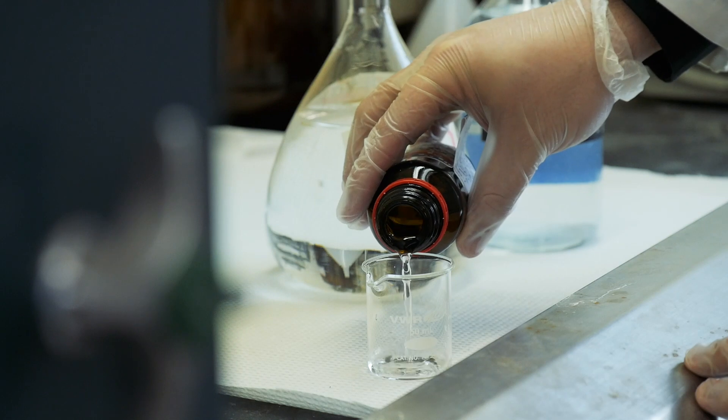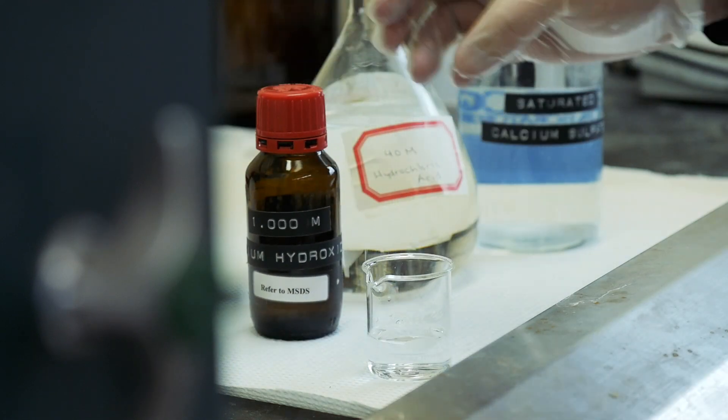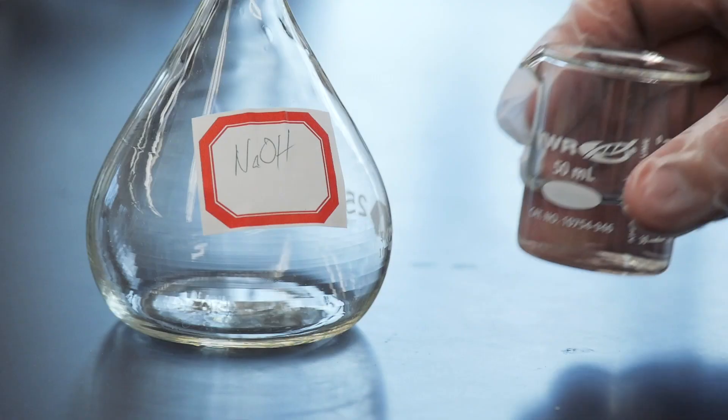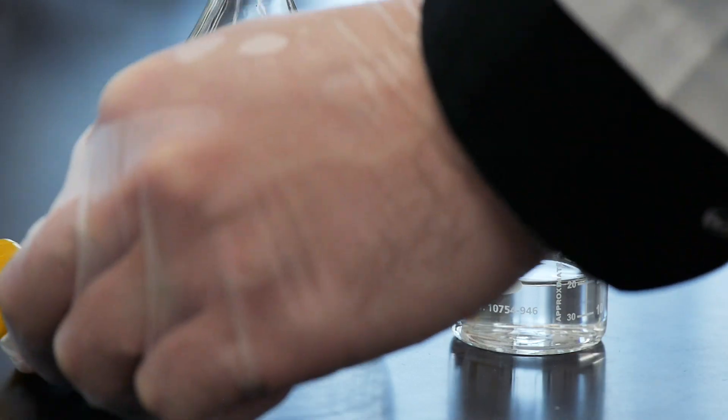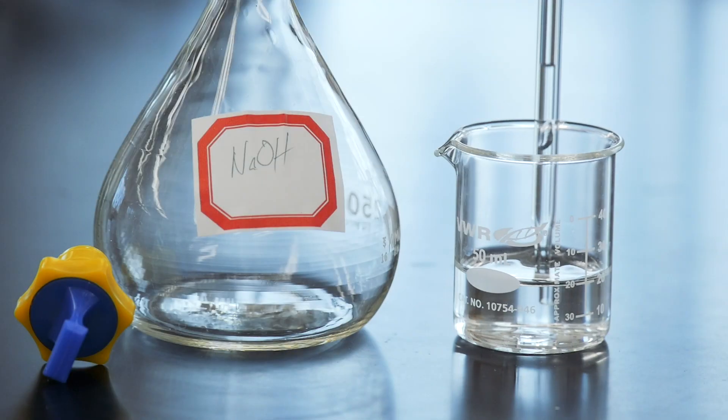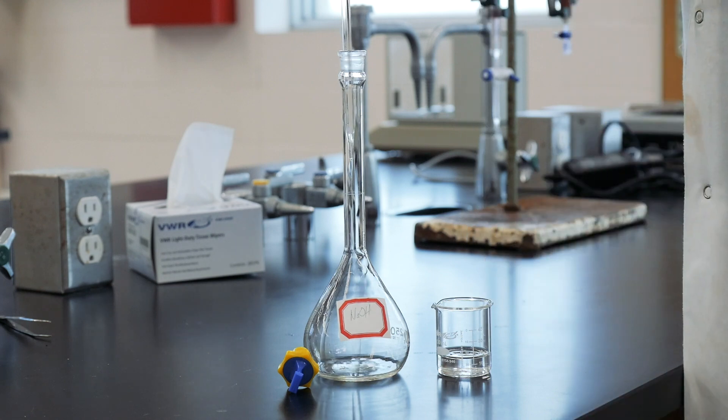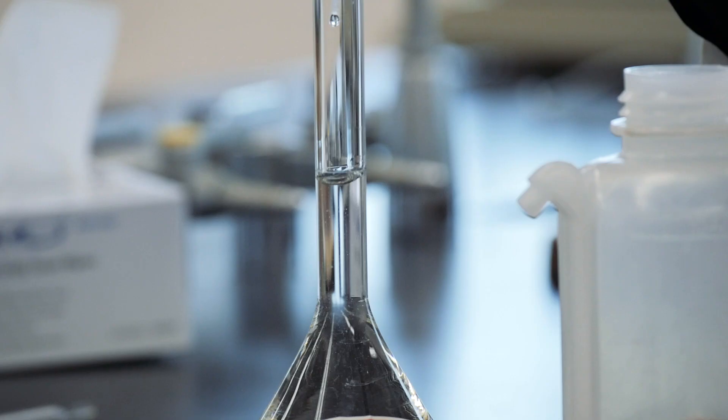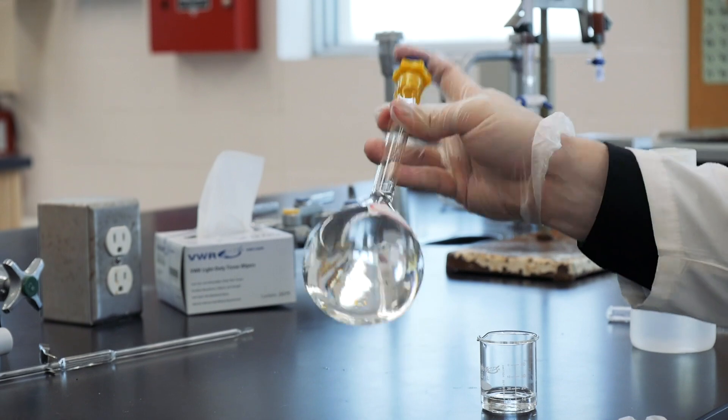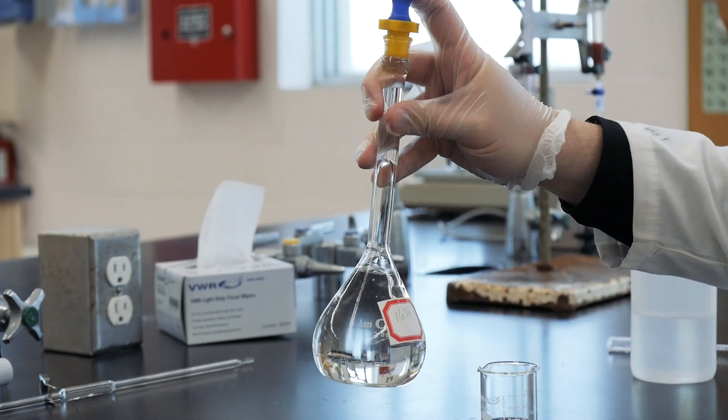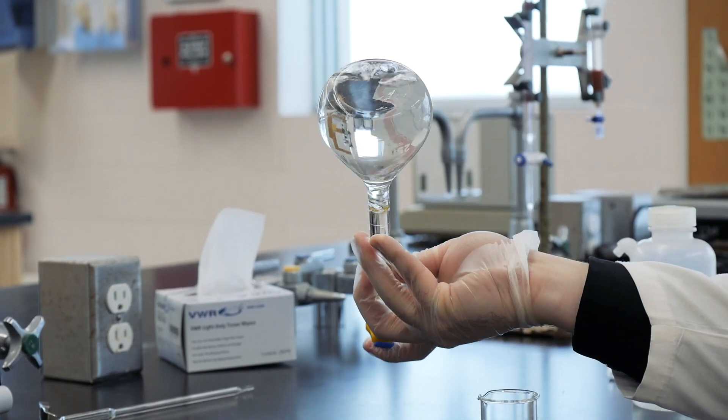To start, collect 20 mils of the 1 molar sodium hydroxide solution in a clean, dry 50 mil beaker. Then pipette a 5 mil aliquot of that solution into a 250 mil volumetric flask and fill it up to the mark with deionized water. Be sure to mix thoroughly. You'll use this solution later when determining the hydrogen ion concentration in your sample.